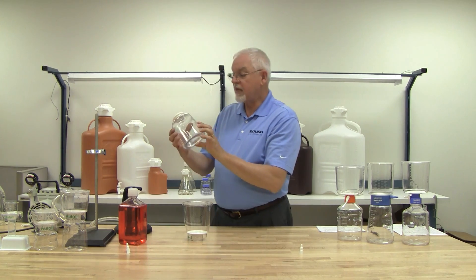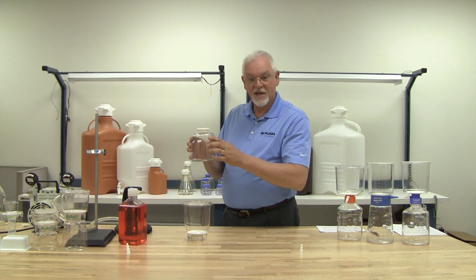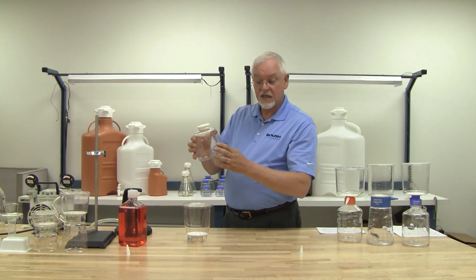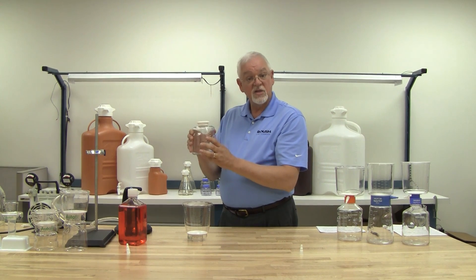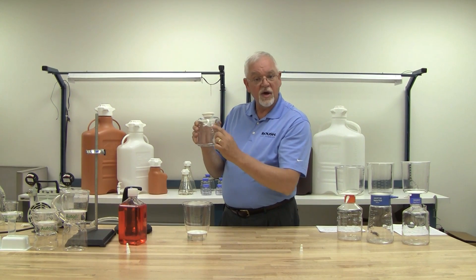In addition, we've allowed extra space at the top of the bottle, which allows us to do up to a 15% dilution. You can also see that there are molded-in finger grips so that people carrying it on the sides are able to do that efficiently. We also have very clear graduation marks.